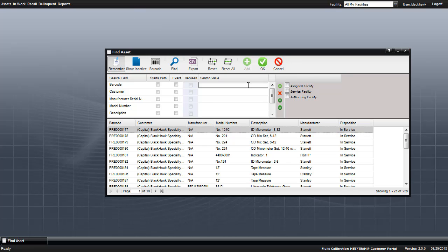So let's say you don't want to have anything to do with barcodes. Usually when a piece of equipment comes through QualiCal, we would barcode it right away. It's good for our quality system. This way we're able to identify equipment, and it helps stop things getting mixed up. We use a barcode reader to pull all the information through. But it's really not anything that will help you at this particular time. So in selecting this, you can hit X and it should delete that particular criteria.